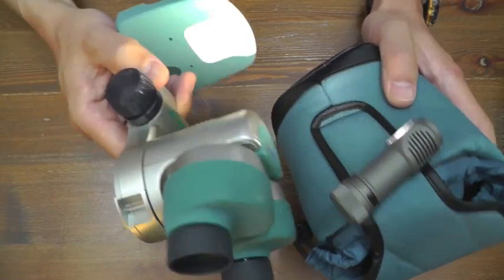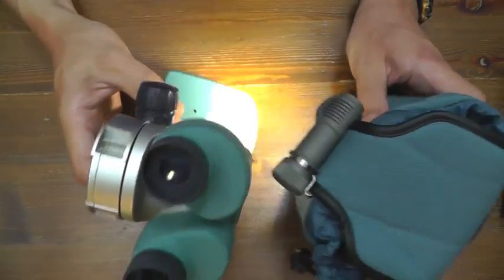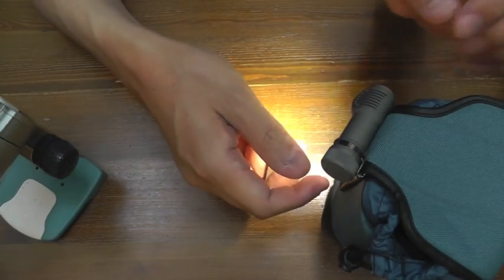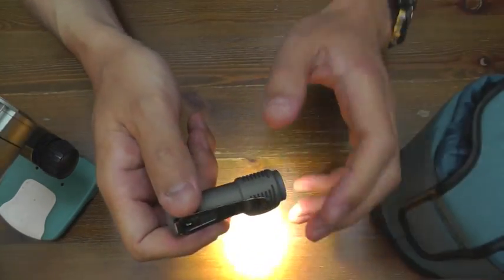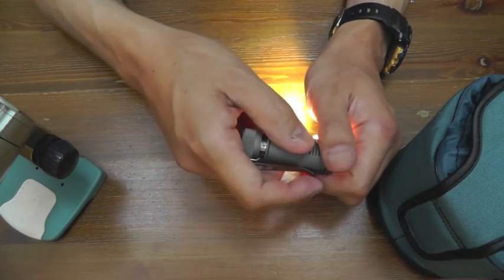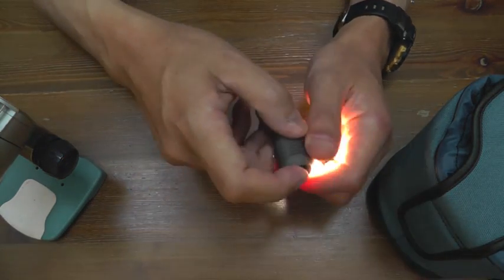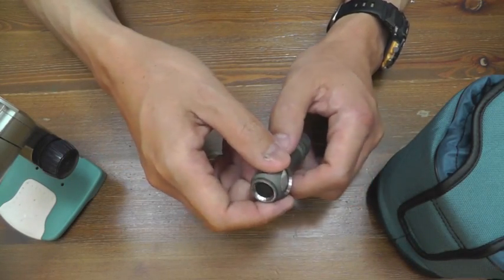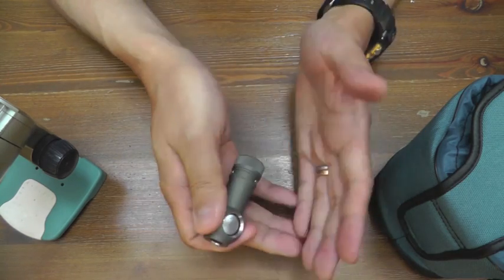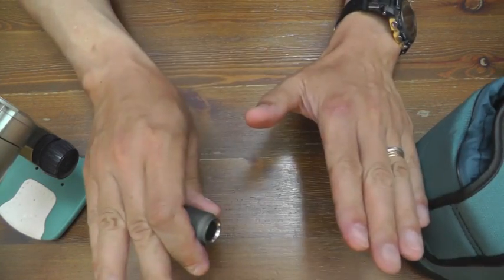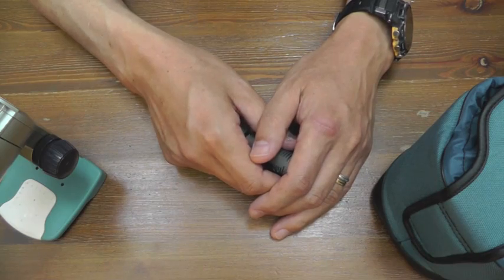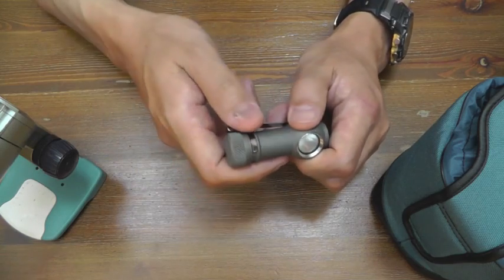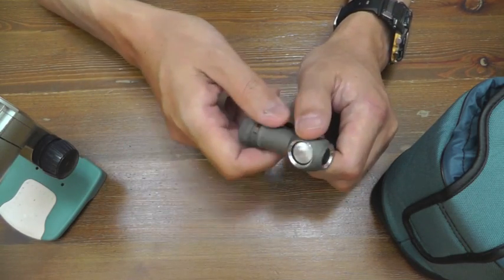So this pair is highly recommended. And now, Zebra light makes a better one, model H502 CRI, which doesn't have a frosty lens but a very shallow mounted bare LED. So, total flood illumination. And amazingly, it generates the same power as this one with a single AAA battery.